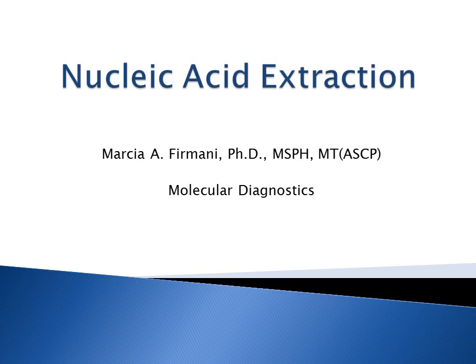So we're finally starting to discuss actual molecular techniques, and the very first of our molecular methodology discussions is going to be nucleic acid extraction.